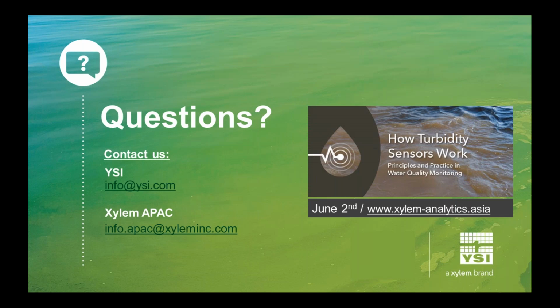Okay, great, Stephanie. I'll move quickly to the next question. Is it correct to assume that the tau PC sensor can only be used for fresh water and the tau PE for marine water? That is a fantastic question. And the answer is that it is not always correct to assume that. Often that is the case. So probably 80% of the time that is the case.